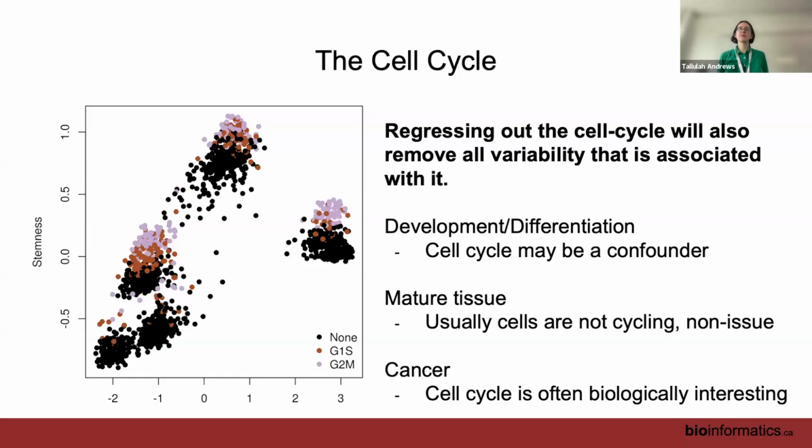But there are other ways of correcting for covariates that might be better than SCTransform. It probably has to do with the fact that they're extrapolating from a relatively small number of genes and a relatively small number of cells. SCTransform also subsets cells so that it runs faster. So we think that might mean it's not actually that great at calculating the values for some of the covariates.